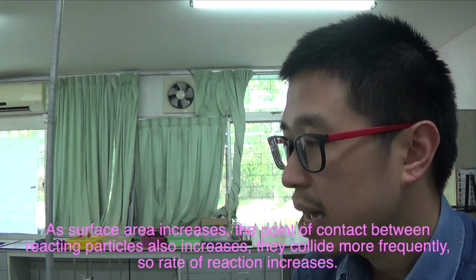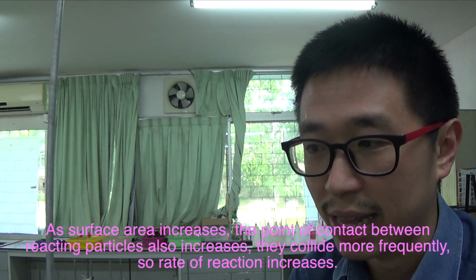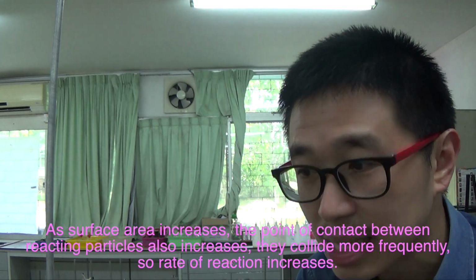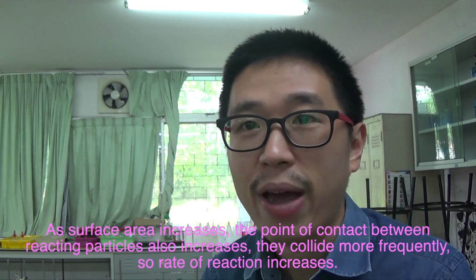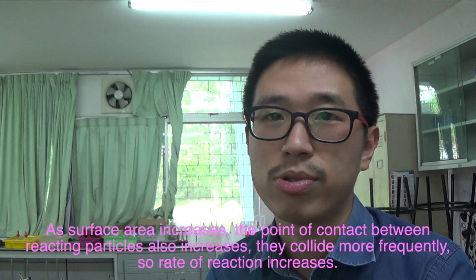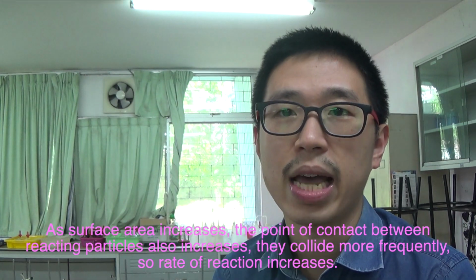So we know that the lumpy form will react a lot slower because in the same time it produces a lot lesser gas. This gas that you are producing is actually carbon dioxide gas. Carbon dioxide gas is a gas that you get when metal carbonate reacts with acid. So metal carbonate reacts with acid to give you metal salt, and also carbon dioxide gas and water.